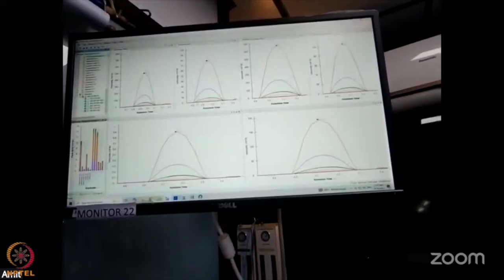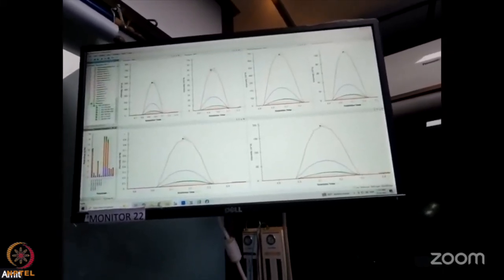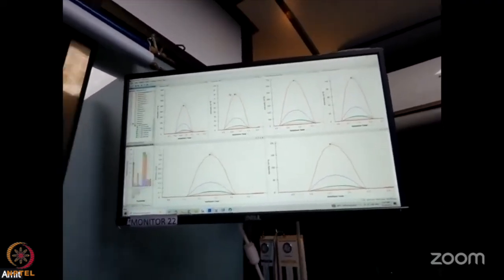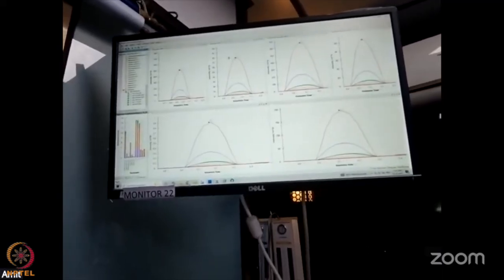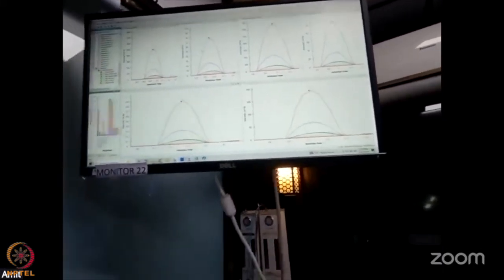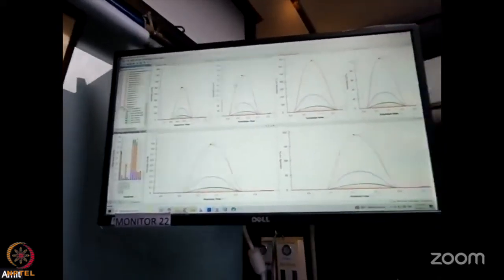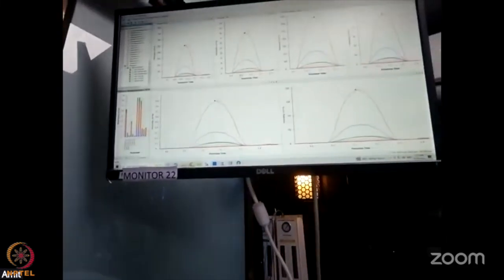After the data acquisition, you will get this type of graph where you can see the retention time. This is coupled to a C18 column, where hydrophobicity is used with different solvent systems, and at 5.2 minutes it has eluted out and we got the peptide.